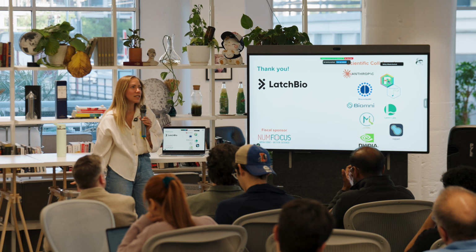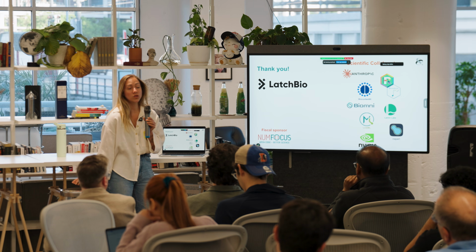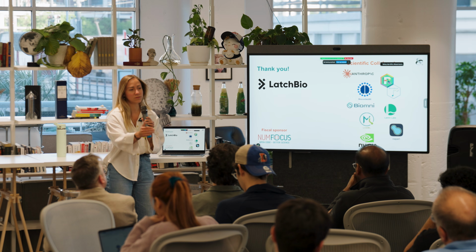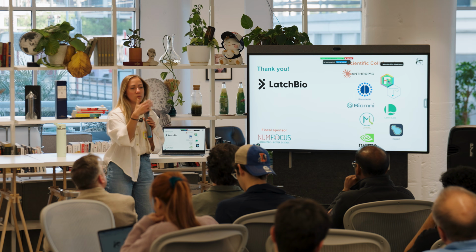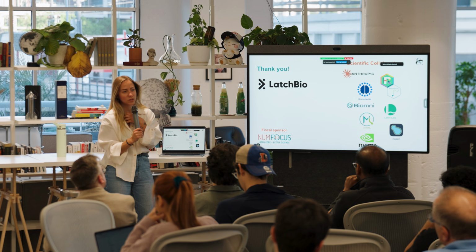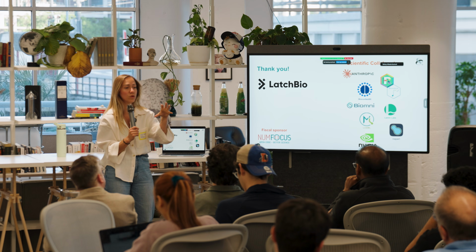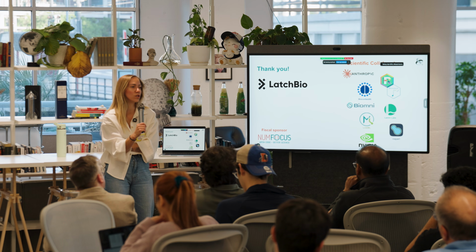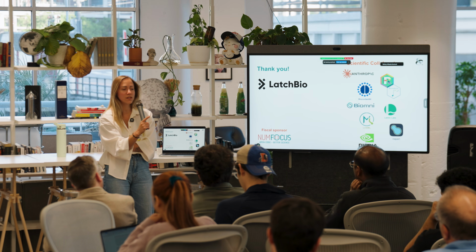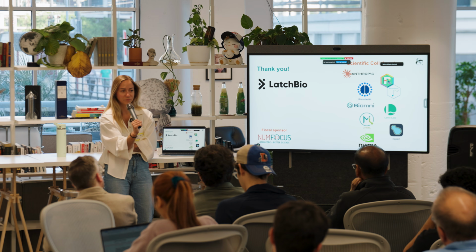The hard thing with the metadata is to decide what you ask from the community to always have. We don't have that so standardized in single cell RNA-seq. You should be able to ask, for example, which version of which 10x Chromium kit was used, and have that always stored. That's one of the efforts we're doing: to pre-decide what everyone needs to always claim in an AnnData object in order for it to be pre-processed. What do you need to store? And that has been a big issue, because now that we're moving to different modalities, each modality has its own requirements. So we're trying to find the bare minimum for everything.